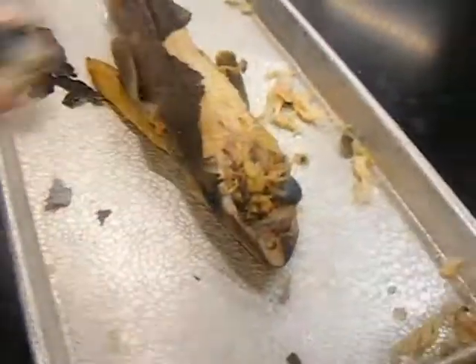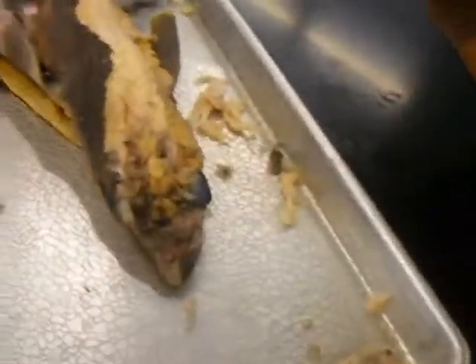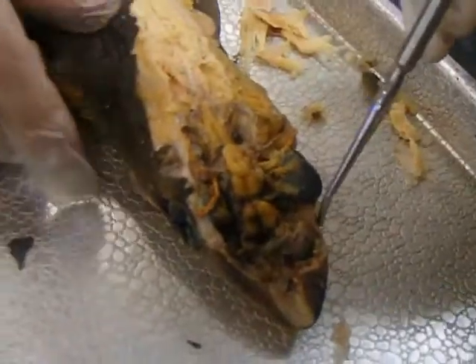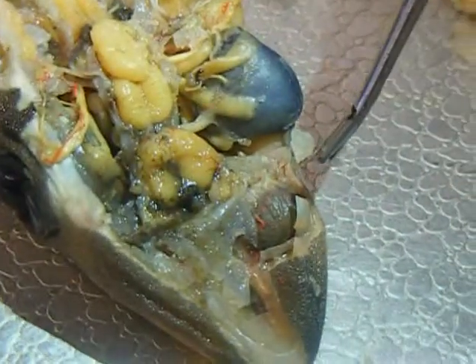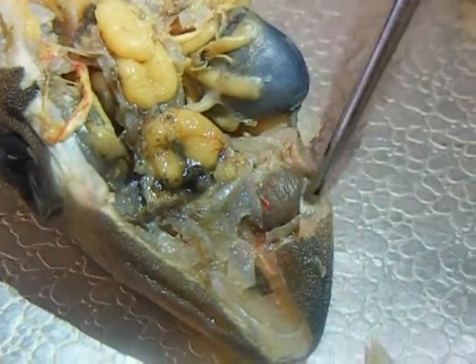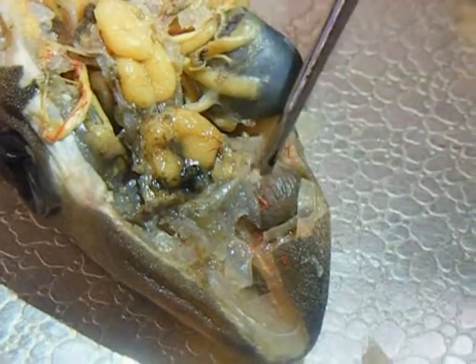The Shark Brain. We are going to start from the tip and work our way to the back. We have the olfactory sac right there, and then the olfactory track.